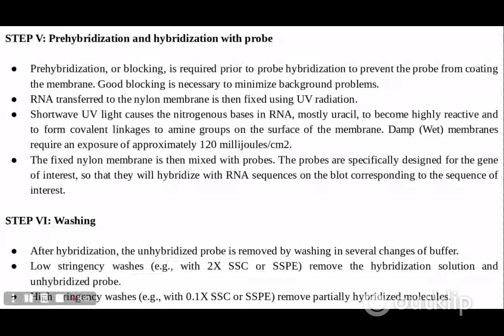Step 5, that is pre-hybridization and hybridization with probe. The pre-hybridization or blocking is required prior to probe hybridization to prevent the probe from coating the membrane, and good blocking is necessary to minimize the background problems.